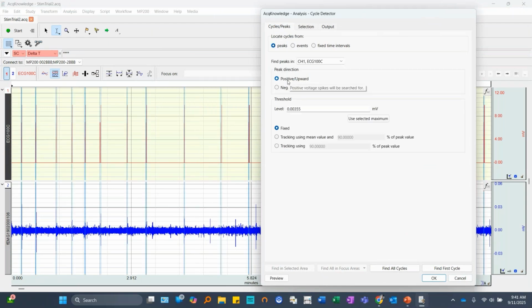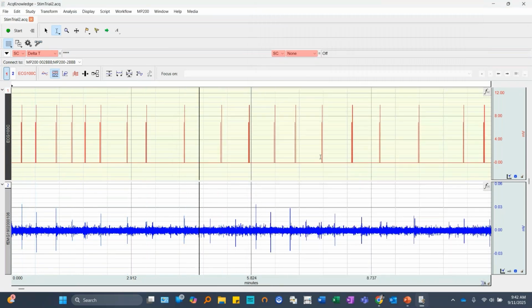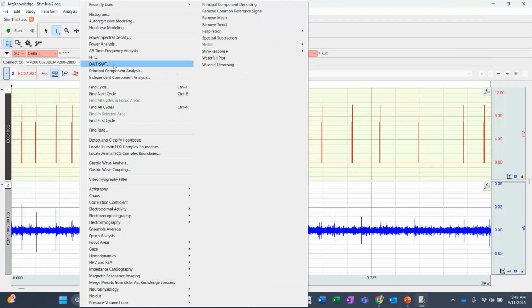Those peaks are positive, of course, and the threshold that we want to use is going to be anything above 7, basically, because our pre-startle pulse, we know we used a constant factor of 7. So anything above that is going to avoid tagging those, and it's going to tag the actual startle response. So if I put in 8 or 9, as long as I don't go past 10, it's going to find all of those.